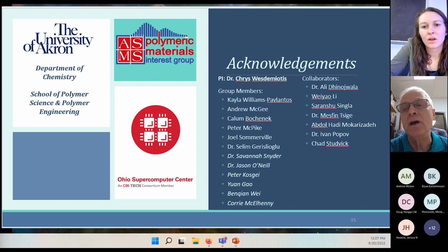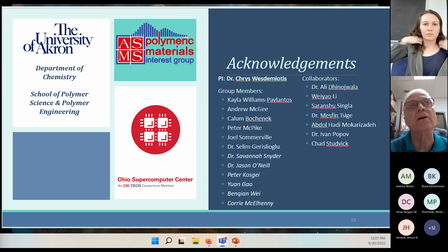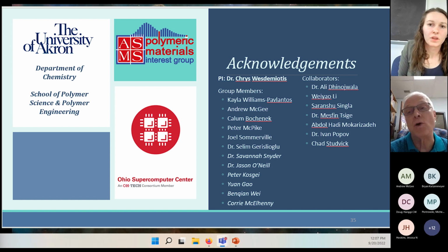GPC will give you the molecular weight distribution of the whole thing. Now, your method could be an advantage if you could get individual molecular weight distributions of components that are not resolved in GPC, and end group functionality distributions, if you can separate that, and so on. End groups, defects, low mass, high mass stuff.